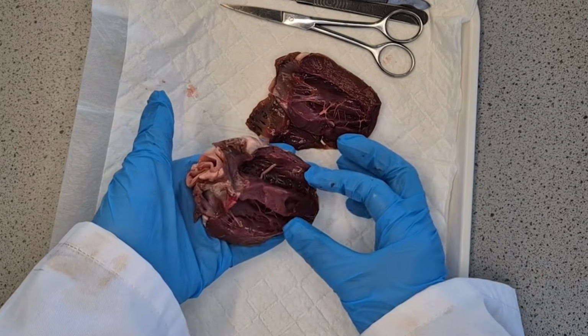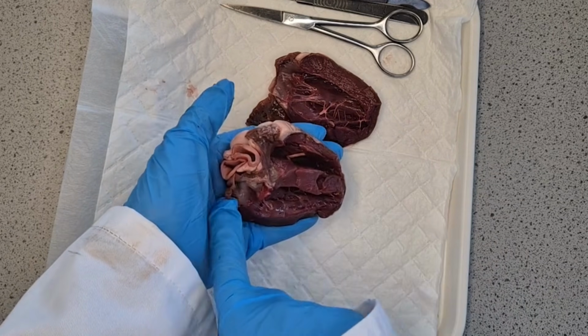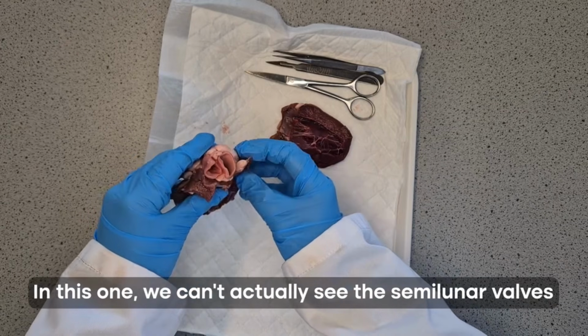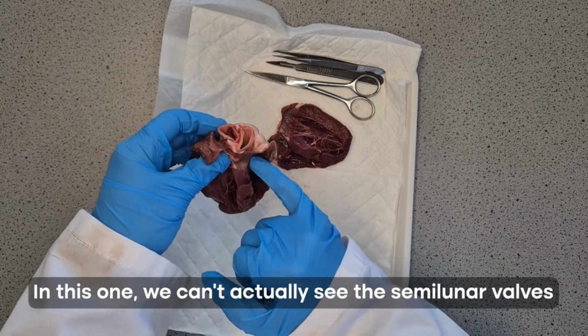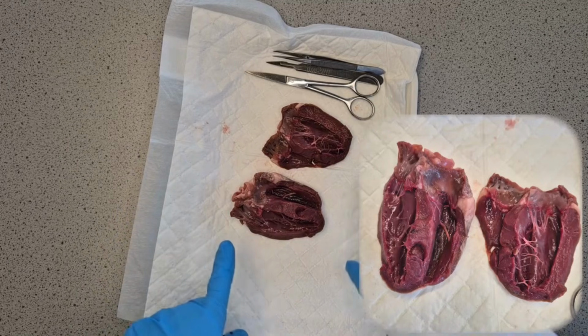So we now know that these are our two ventricles. We've got the two atria at the top. We've got the atrioventricular valves. In this one, we can't actually see the semilunar valves, but those are the valves that are between the two arteries that leave the ventricles and the ventricle, but they're not actually visible on this one. So I'd then get them to take a photo of this, and then they can label that.